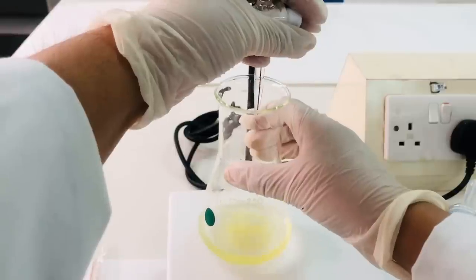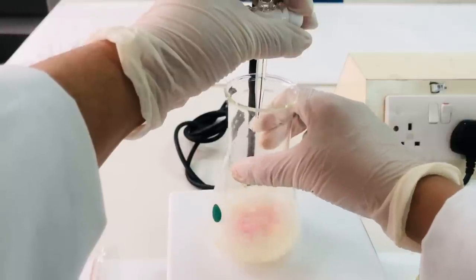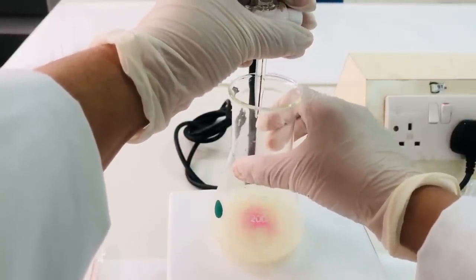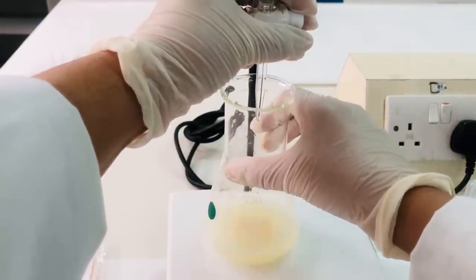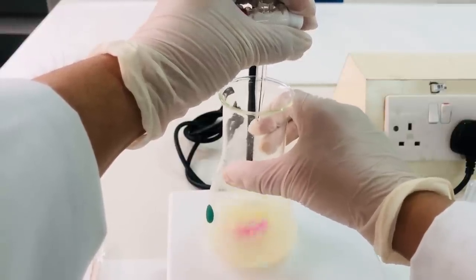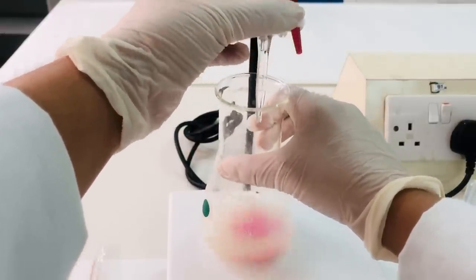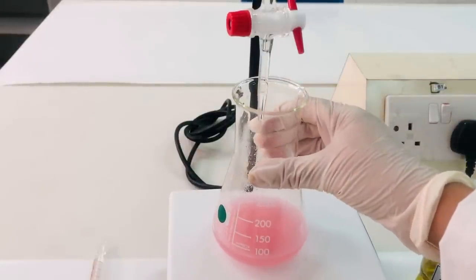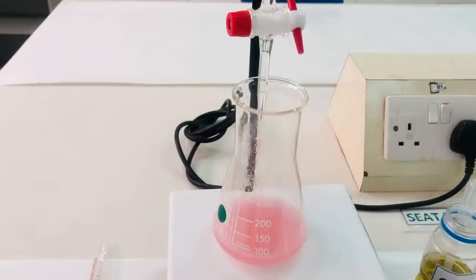Drop wise, add the standardized alkali solution. Add the alkali solution drop wise and wait for the appearance of a persistent pink color. A persistent pink color, which is pale, shows the correct end point of the titration. Record the burette reading. You have to repeat the titration for 2 concordant readings, which are either same or in a gap of 0.1 ml.